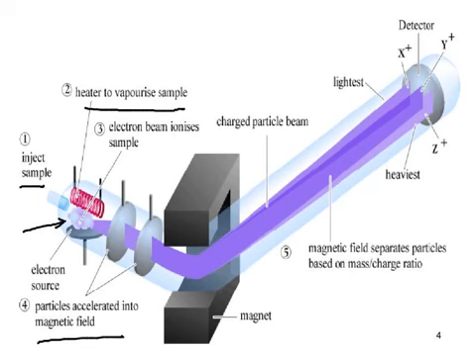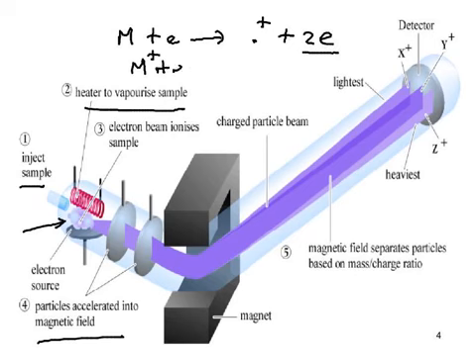Next, we have an electric field, and the purpose of the electric field is to get the positive ions that have been created because the molecule has been struck by an electron, creating an M+ molecule plus 2 electrons. That's the electron that it was struck by, plus the electron that's come off the molecule. Now, sometimes that M+ ion will be struck by another electron and create an M++ plus 2e-. But these will be much more scarce, of course.